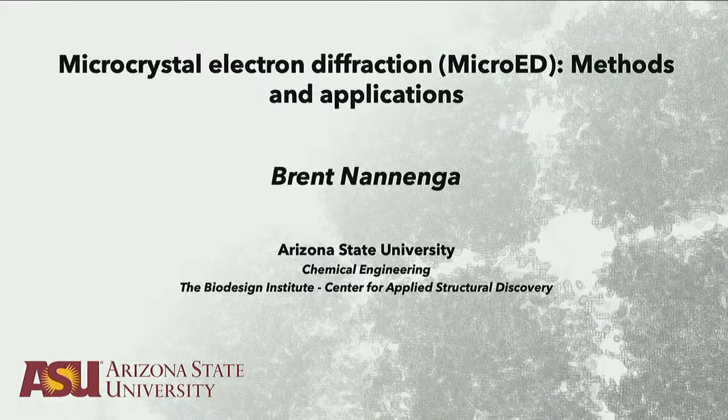So as Jose mentioned, I'm going to talk today about this technique of microcrystal electron diffraction, or MicroED. The first bit of the talk will be focused on what the technique is, how we use it, what the steps are, and what the workflow of the technique is. Then I'll move into applications. How do we use it? It's going to mostly focus on biological samples, and then towards the end I'll give some examples of small molecules, because that's been, I don't want to say unexpected, but a surprising application of MicroED that's exploding right now: applying it to small molecules and samples from materials science.